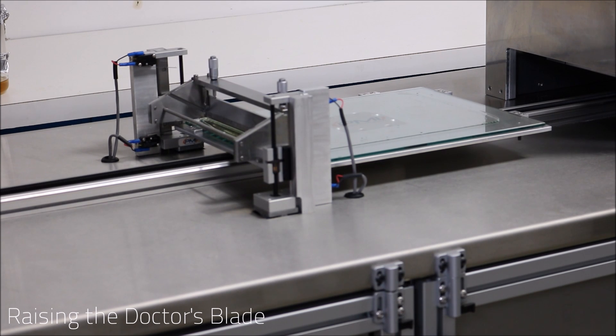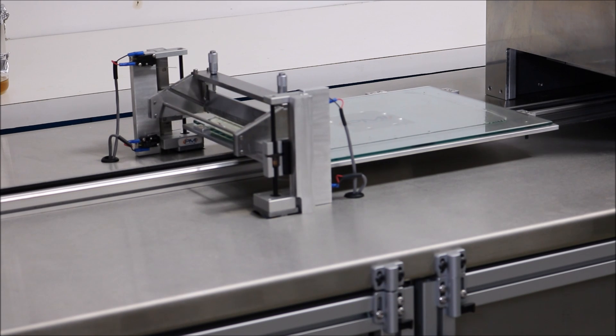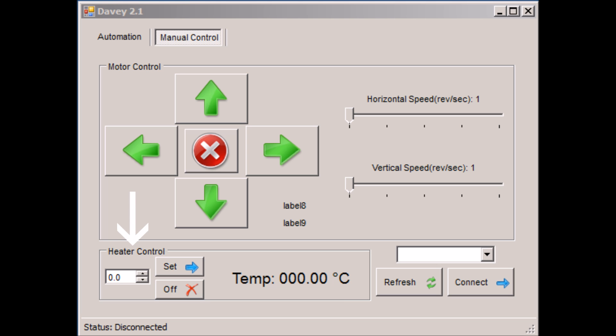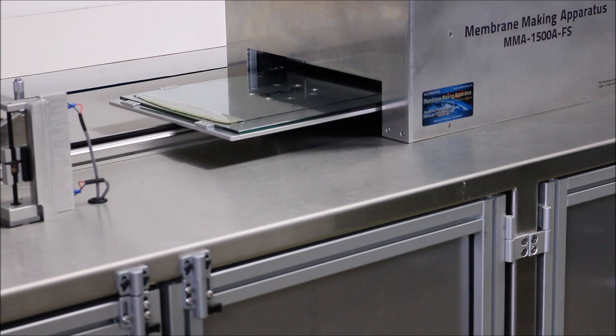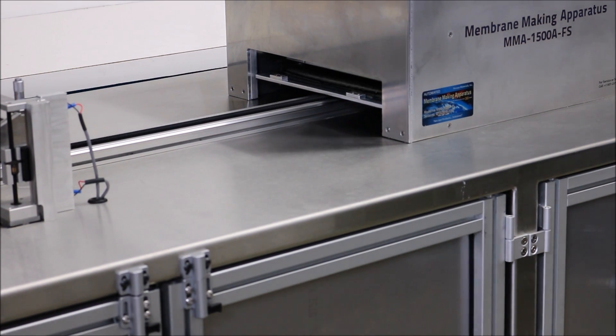After raising the doctor's blade up, we can now continue with moving the membrane casting plate into the infrared heater. You can use the heater control in the manual control panel to set and monitor the temperature of your infrared heater. After the membrane casting plate has come to a halt, allow the polymer solution to heat to your desired temperature and for your desired amount of time.